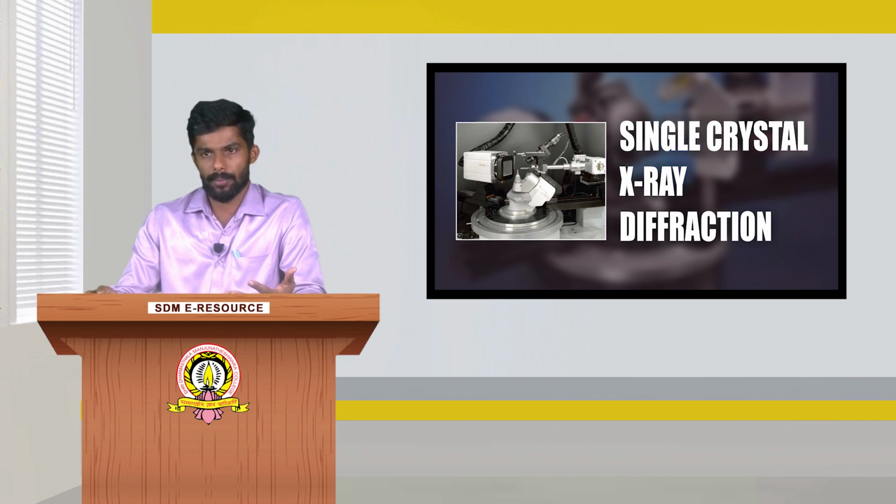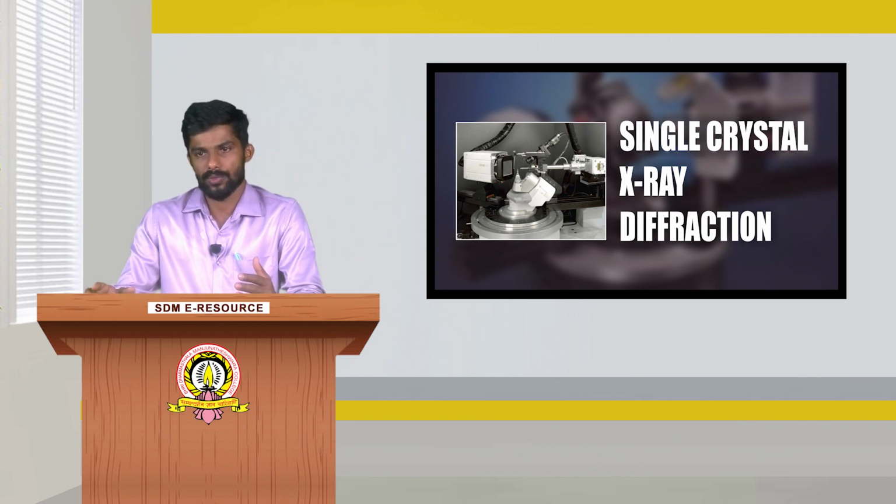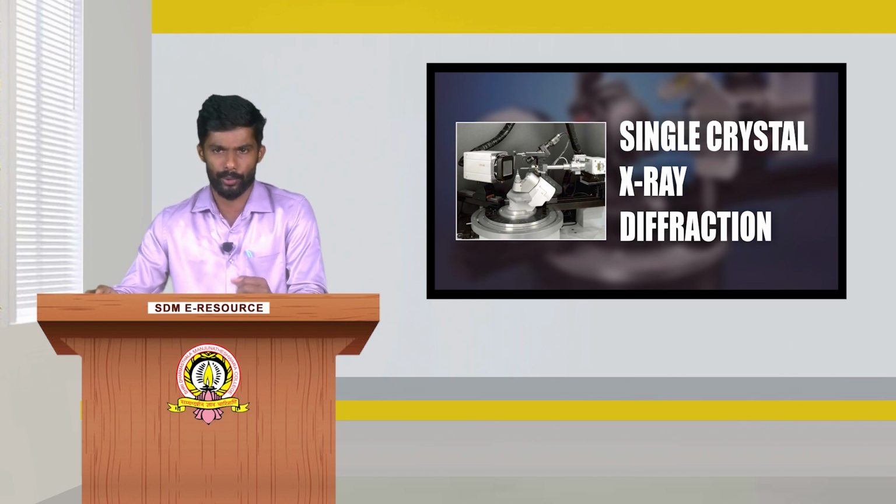Say it is a video camera or the microscope, which is helpful for aligning the specimen or the crystal and also indexing the crystal faces. So one can rotate the crystal on the goniometer head and look at the different faces of that crystal to get the reflections from different faces. Usually the well polished, shiny face is exposed to the incident beam. That is done with the help of this video camera or the microscope.